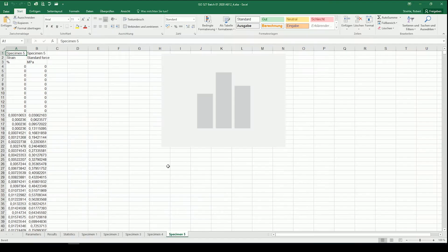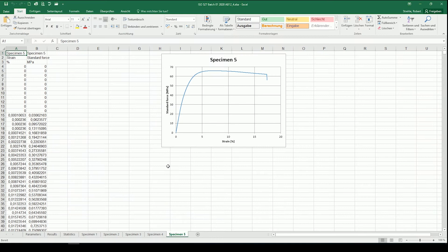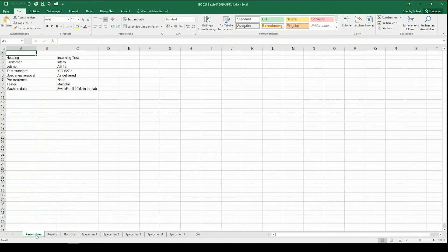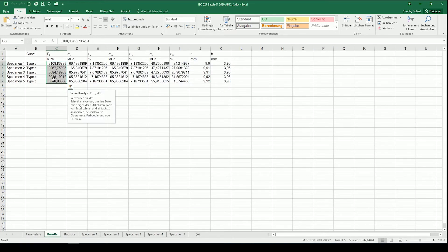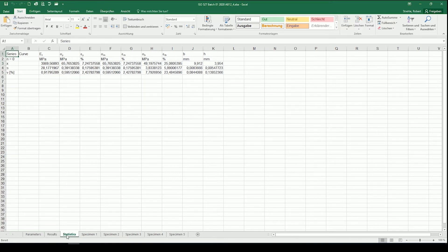All test results, test parameters, and selected raw data are exported to Excel automatically. There is one file with all the data nicely separated into different worksheets. This is exactly what my boss wants to have.